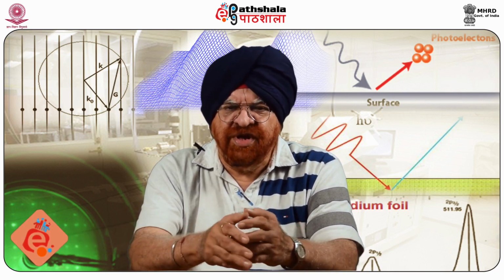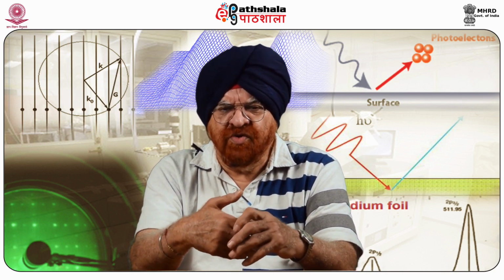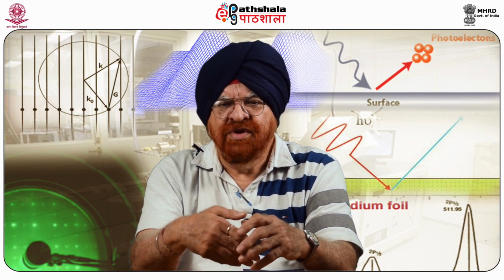I hope this has clarified Kelvin probe force microscopy, which is a very recent technique and has not been put into very many areas, but looking at the fineness of this, it is certainly going to be a very powerful potential technique in the future to come.